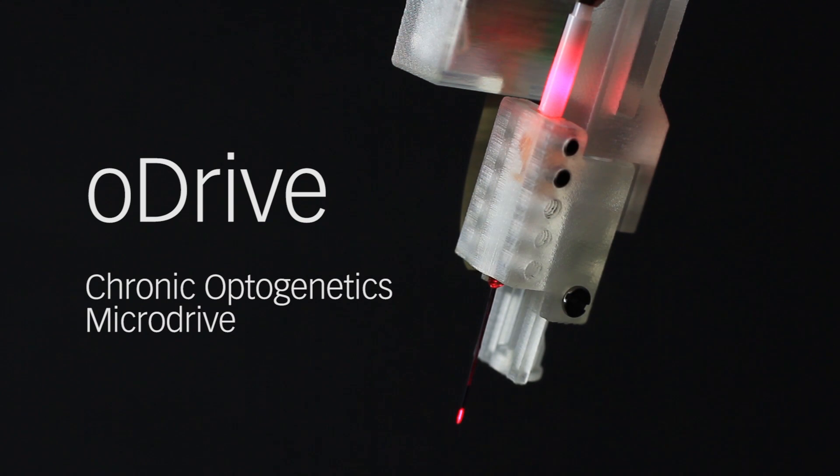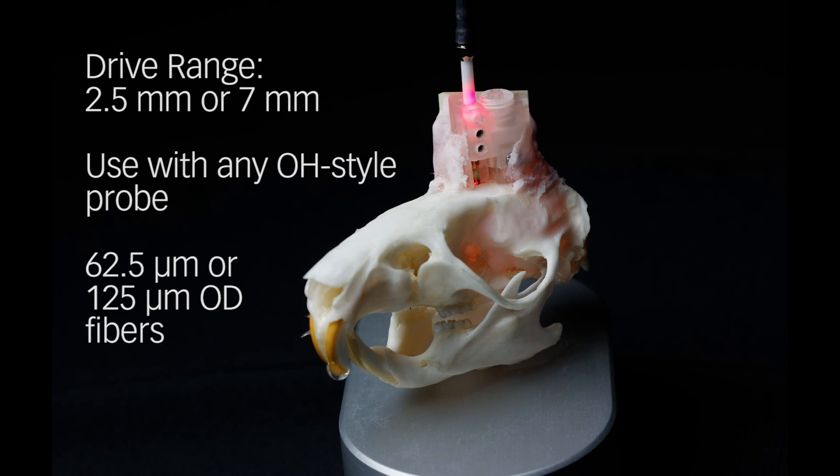The Neuronexus O-Drive combines a chronic microdrive with a Neuronexus optoelectrode to facilitate chronic optogenetics experiments. As with the standard D-Drive, the O-Drive is available in two drive ranges: 2.5 mm and 7 mm.